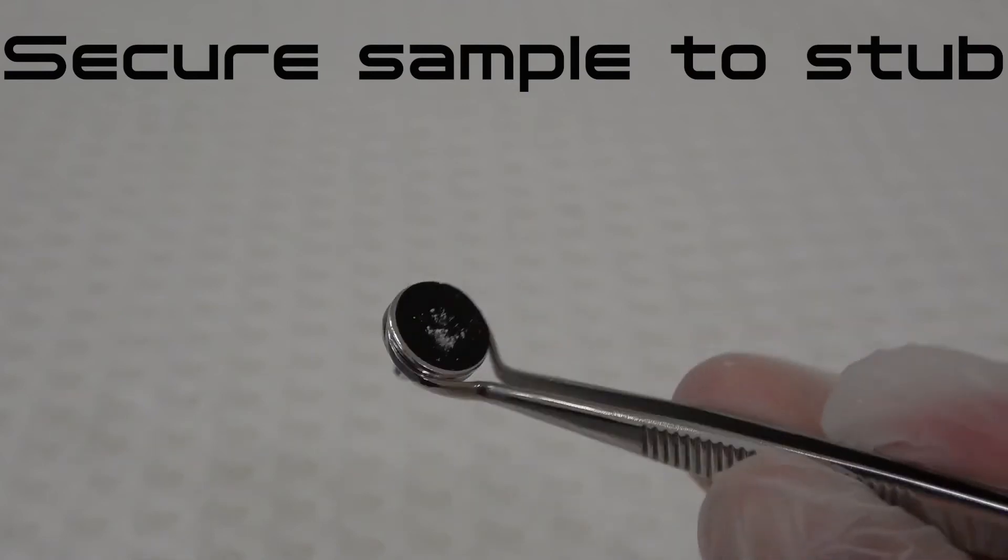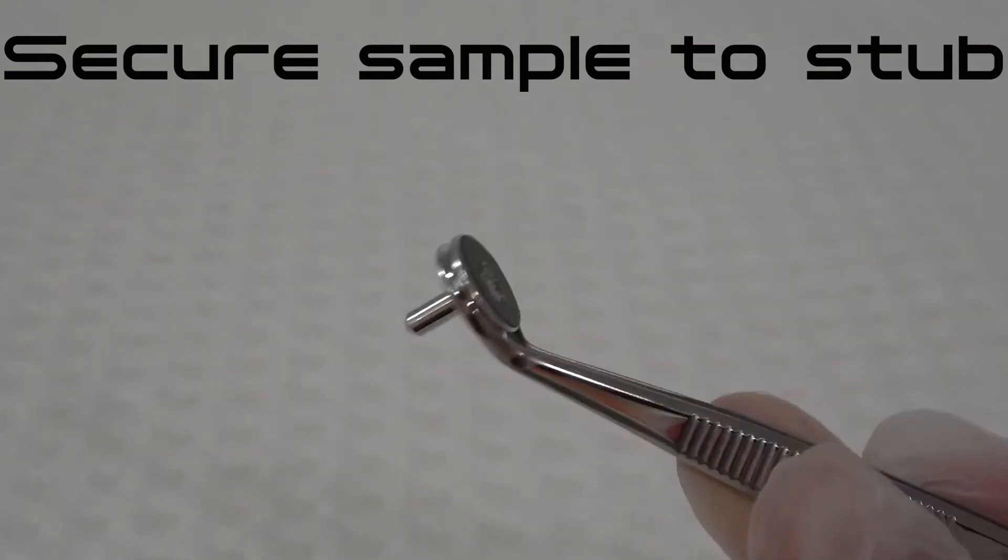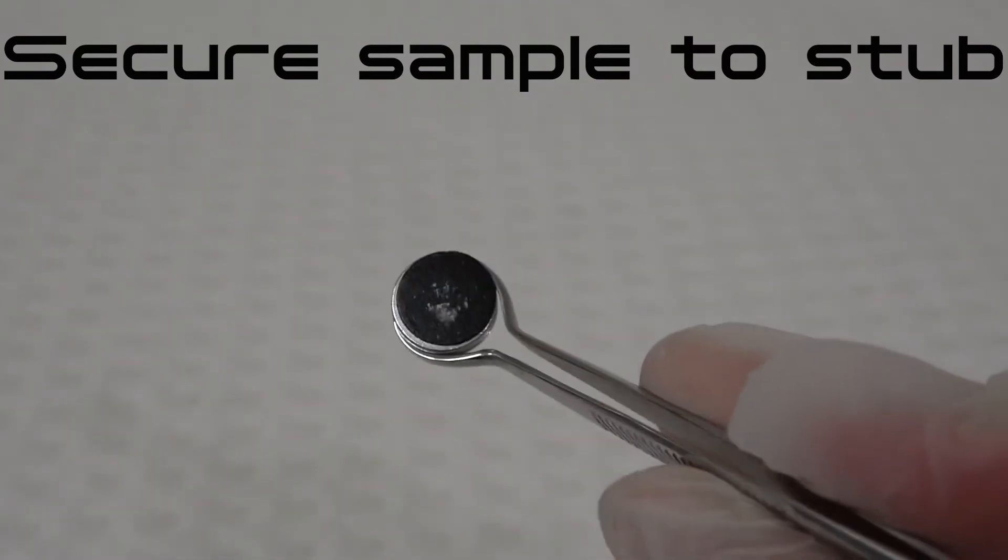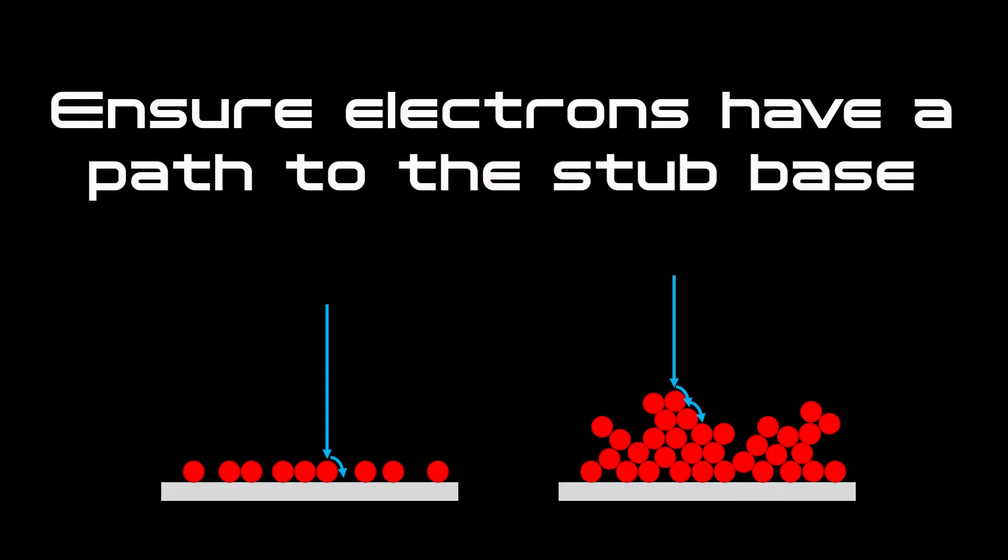When mounting powdered samples for SEM, our main goals are to secure the sample particles to the SEM stub so that they do not move during SEM examination, and to ensure the negative charge generated by the electron beam has a pathway away from the surface of the particles to the conductive adhesive and stub base.